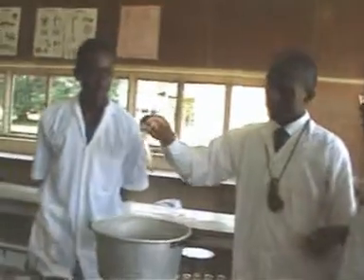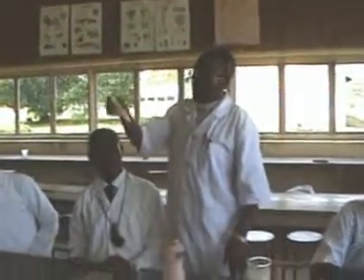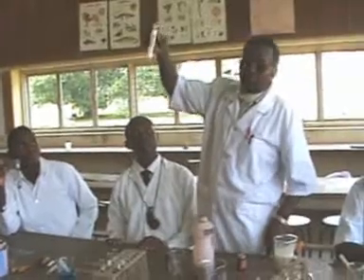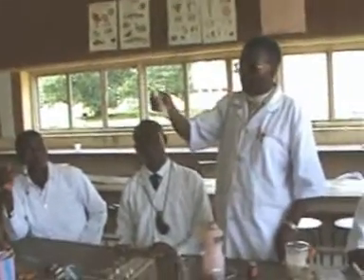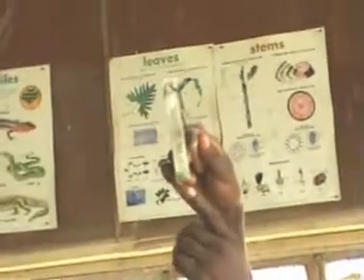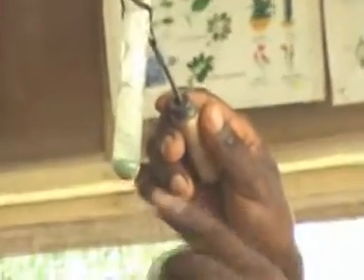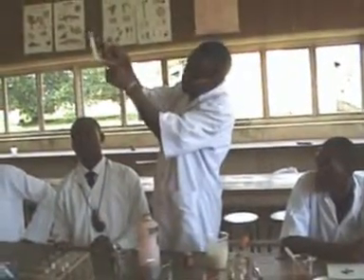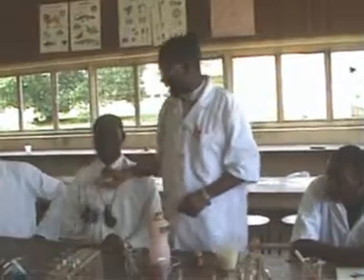Take it, all right. So we have seen that on heating, this is the test because we are testing for simple sugar, that's glucose, using the Benedict solution. So on heating for about 5 minutes, we see a brick red precipitate which is settling down here. We can see the red color. So this is the brick red precipitate that has settled down here. And the concentration is not all that good, but it is there. So this implies that this particular food substance contains glucose. And that is why we have this brick red precipitate down there.